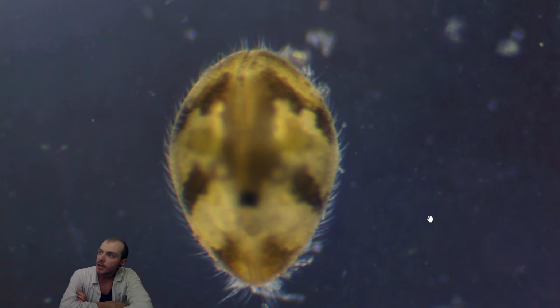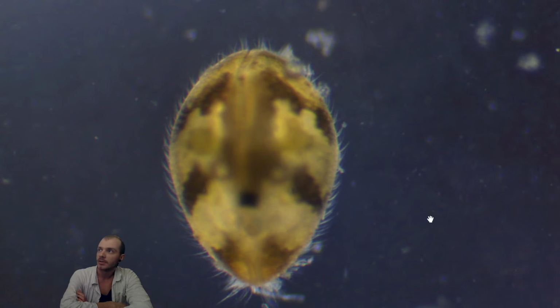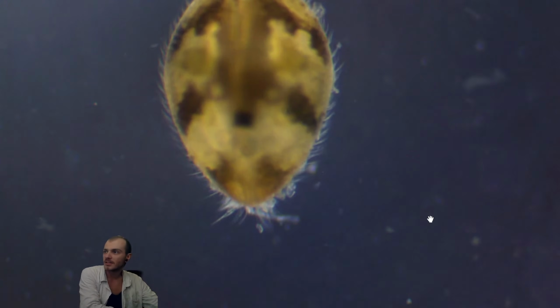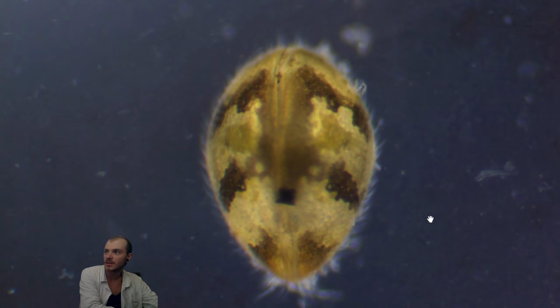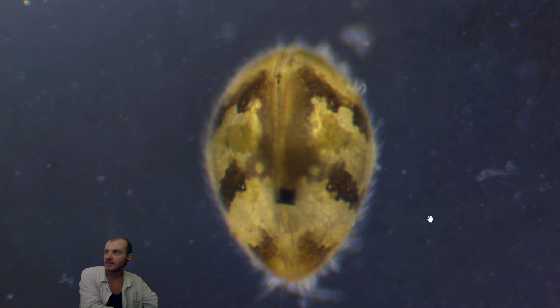This is probably the smallest thing I was transferring by a paper and pipette and so on. This was a little bit of a challenge, but it is possible. It is interesting to see how careful you need to be with such small things, but under the microscope you can see how organized they are.